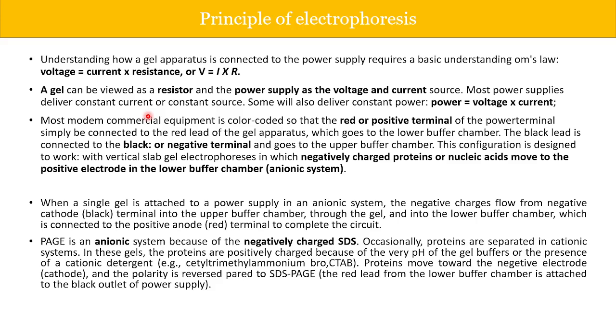The gel can be viewed as the resistor, and the power supply as the voltage and current source. Most power supplies deliver constant current or constant voltage, and also deliver constant power, because power is equal to voltage into current. So a constant power is very important for the movement of the molecules upon loading it on a gel matrix.